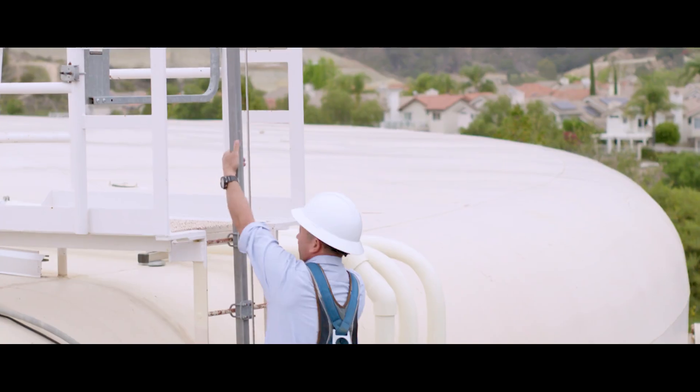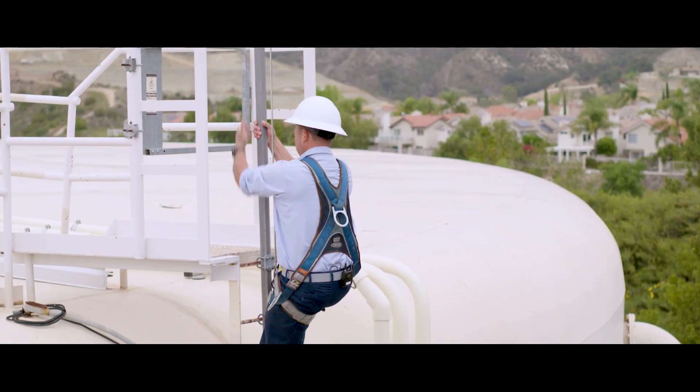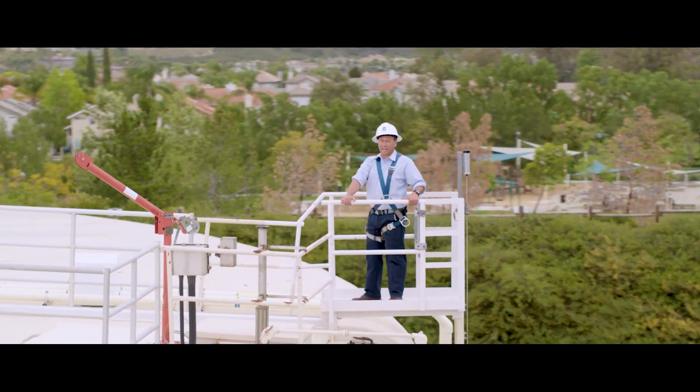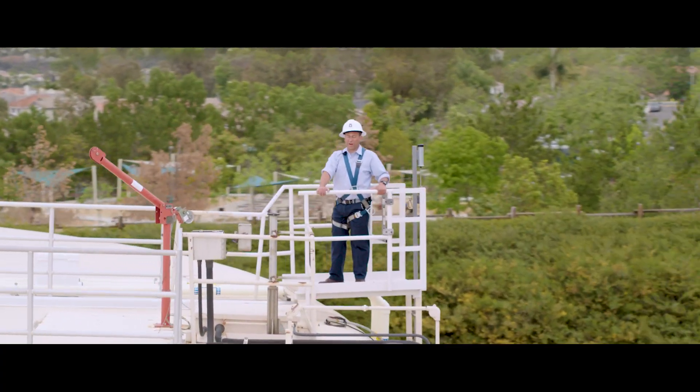We rise early and climb high. We're the Irvine Ranch Water District. We go far and wide testing your drinking water on a regular basis.